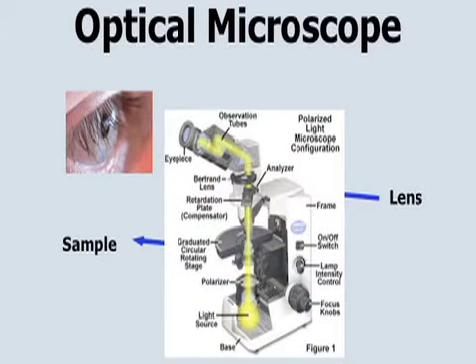I actually have the sample here that I'll pass around later. In terms of the optical microscope, it's not much different than what was discussed about the path of the light to the eye. So we have a light source that will hit your sample. It can pass through, or it can come from another position, hit the sample, and it has to reach your eye, or a camera, or a detector there.